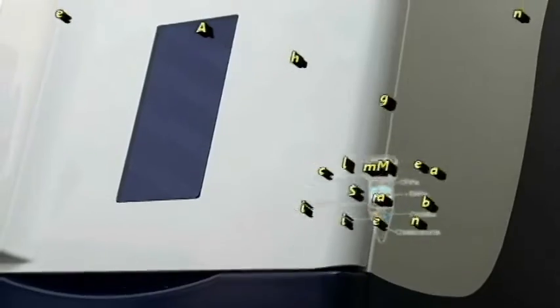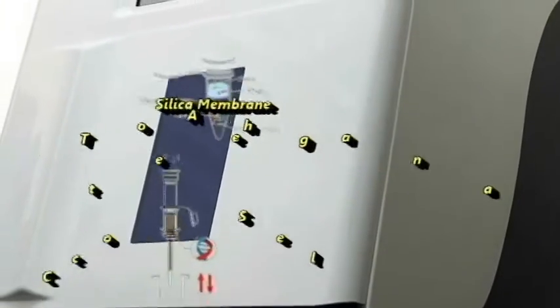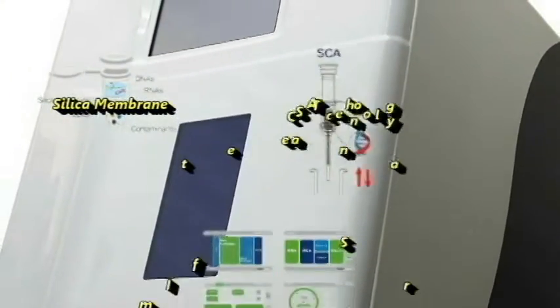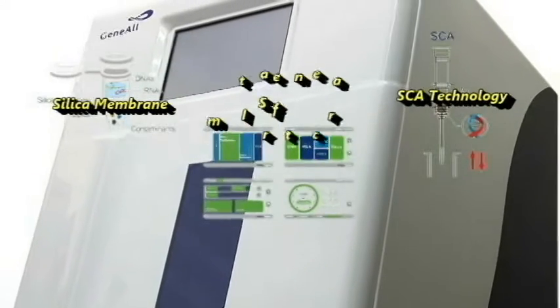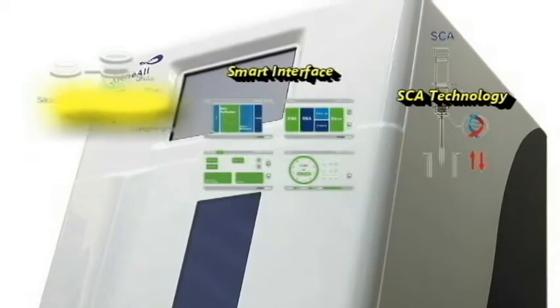With silica membrane extraction, SCA technology, and a smart interface, Steady brings you reproducible results in high yield, high purity.